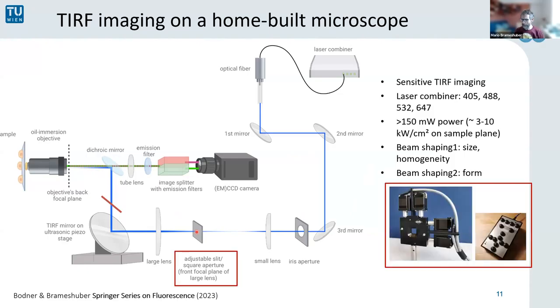And here's the nice thing: because we're a technical university, we get a lot of students from physics courses and classes, and they're very interested in building their own microcontroller-based hardware. We have these nice motorized apertures, which can be controlled by a little microcontroller, and it's very convenient because you just have to press a button and you can change the field of view, not spending more than, I think, 200 euros in addition to buying the mechanical aperture.